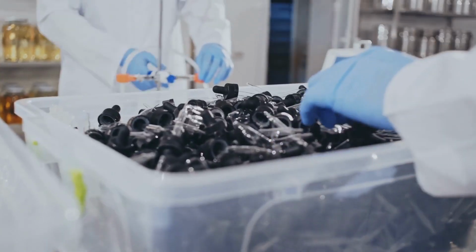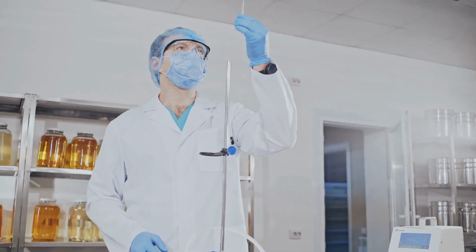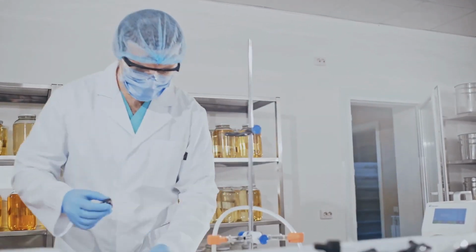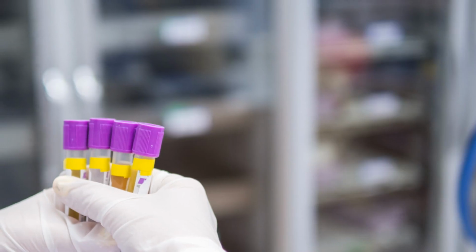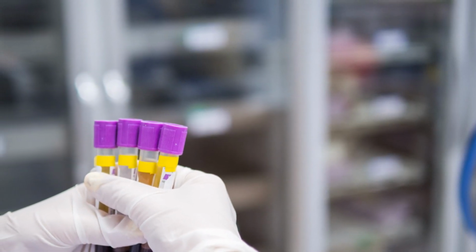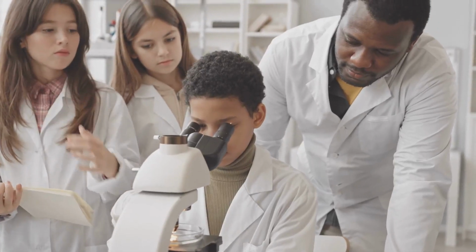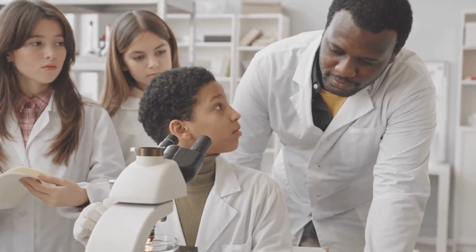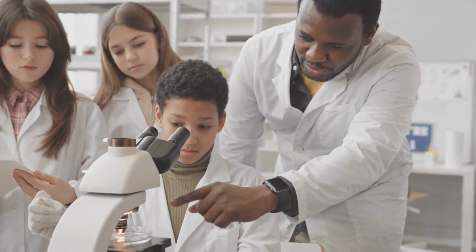You finish with aseptic techniques, which are important in ensuring that we do not contaminate ourselves, our samples, or the environment around us. An understanding of the topics covered in this first section will prepare you for your future allied healthcare profession by giving you an opportunity to develop the skills necessary for preventing contamination, handling specimens properly, and supporting accurate diagnosis and patient care.